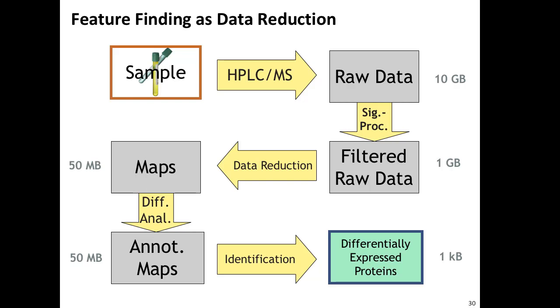Yes. So, in terms of feature finding, let's say you have 3 biological replicates in 2 conditions, so 6 samples each. How many of the samples do you need to find a single feature in of one condition in order to say that that's a real thing? Let me explain how we find the features, then that will follow automatically. I hope I understood your question correctly, but you need just one run to find the features.